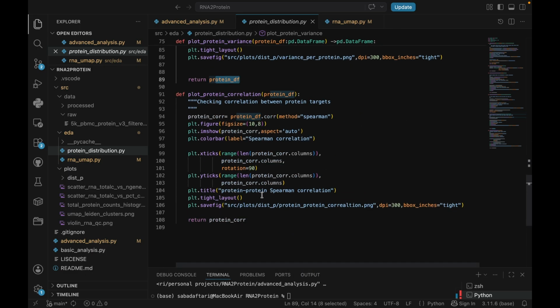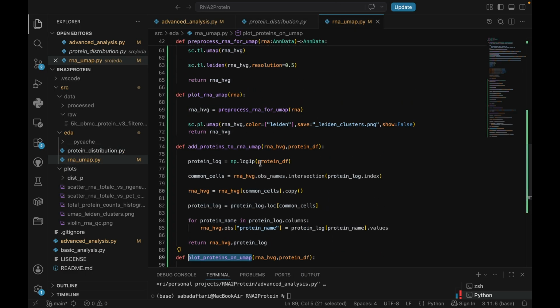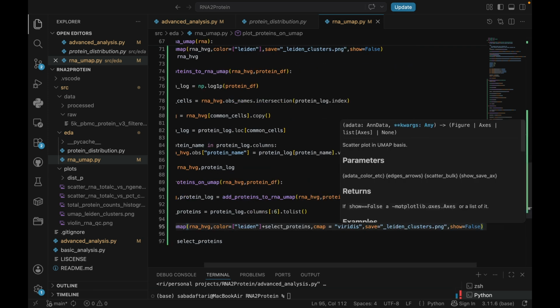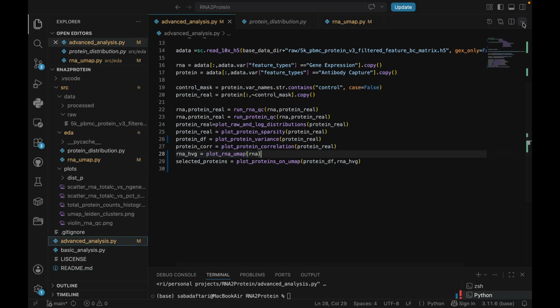And so I am going to save this. Now let's run.